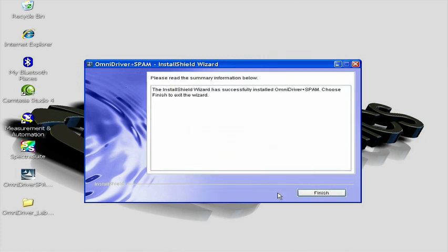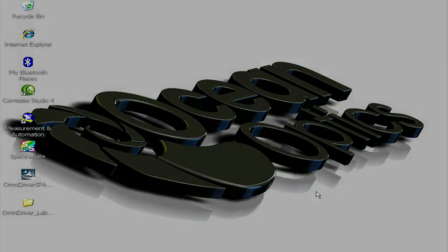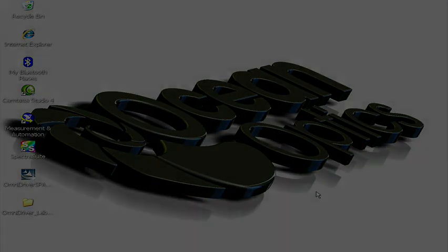You have now successfully installed Omni Driver plus SPAM on your computer. Click Finish to exit the installer.